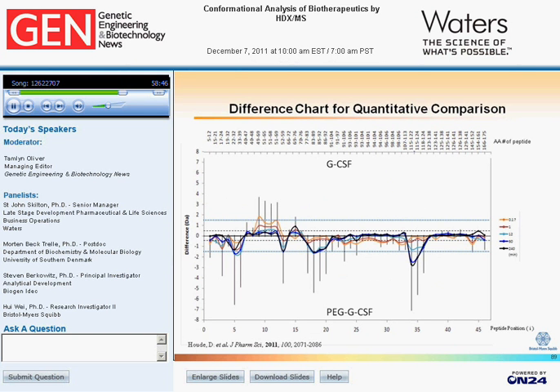When the value of each bar is above the black dotted line, which is plus minus 1.5 Dalton, then we consider it a significant difference in deuterium incorporation. In addition, it is also considered a significant difference at an individual labeling time point when the individual difference value on the curve is greater than 0.5 Dalton, which is represented by the blue dotted line.